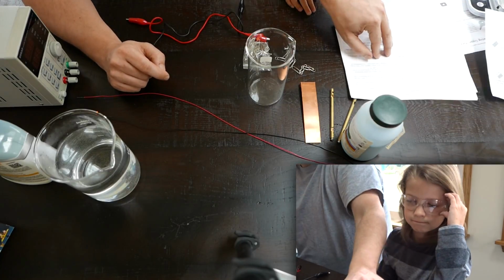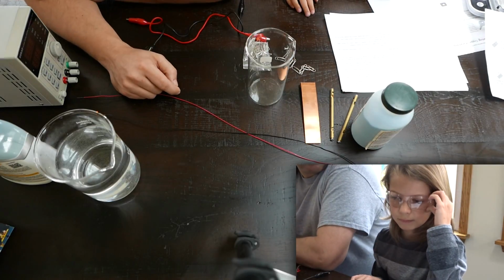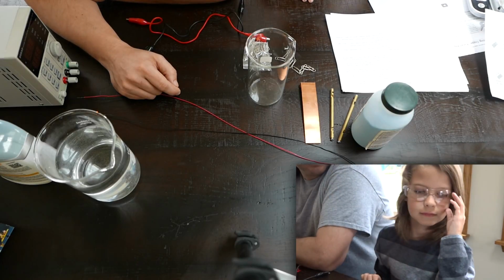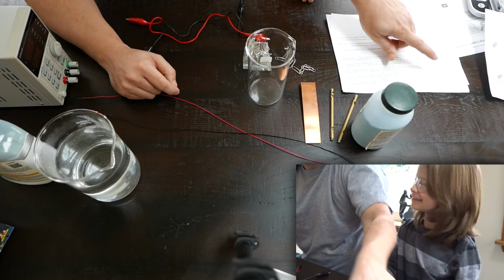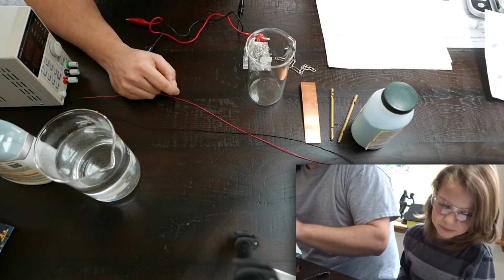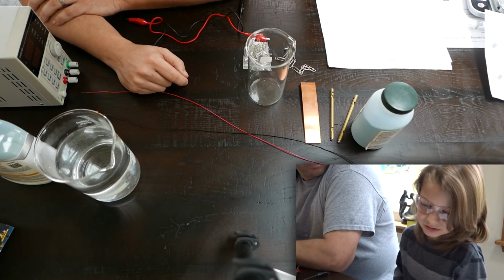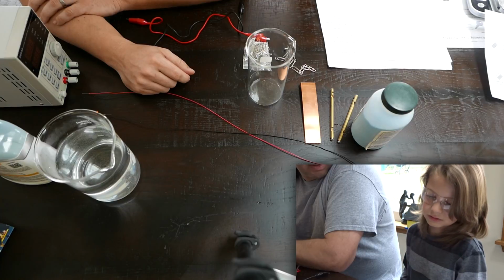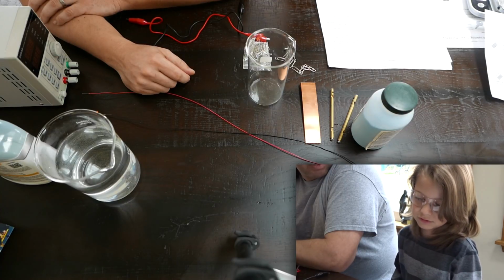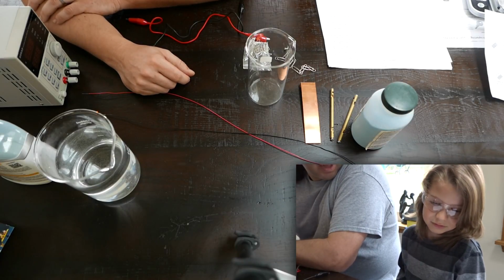So let's just go through here. So what was the red? Flammability? What was it, 0? Yeah. And what does 0 mean? Right here, I'm sorry. See, this is flammability, 0 through 4. Materials that will not burn under typical fire conditions. And they have an example there, including carbon tetrachloride. Okay, so we're safe with that, right?